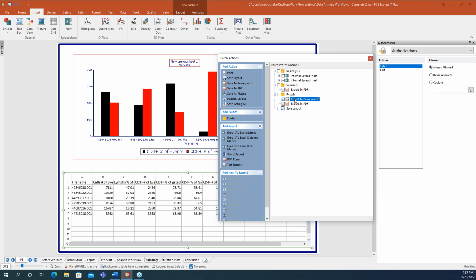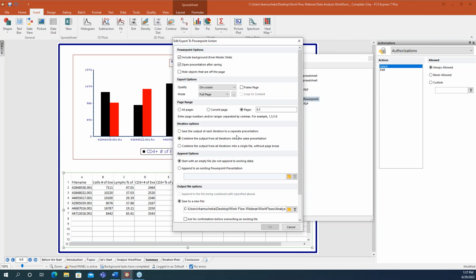So I'm going to look at some of our results here. We're also able to customize all of these features. So you're able to define what it is that you want to be reported, and what you want to do with it after it is reported out, after you've created this PowerPoint. I always open everything. I like to see what's happening. I do the pages here.